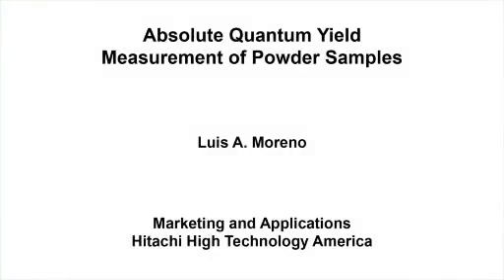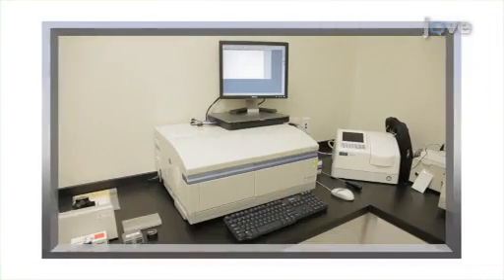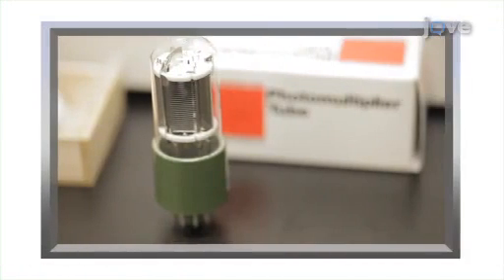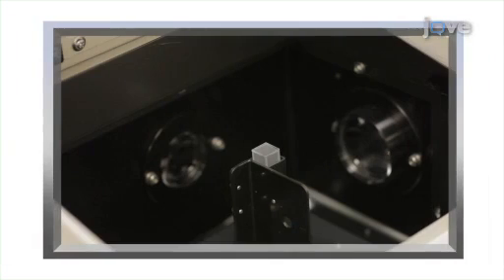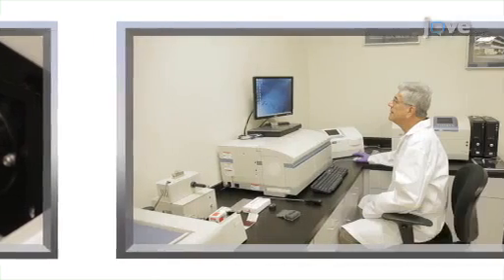The overall goal of this procedure is to measure absolute quantum yield of powder samples using a calibrated Hitachi F7000 fluorescence spectrophotometer. The first step of the procedure is to collect the integrating sphere correction factors to account for the reflectivity of the integrating sphere used for the measurements.